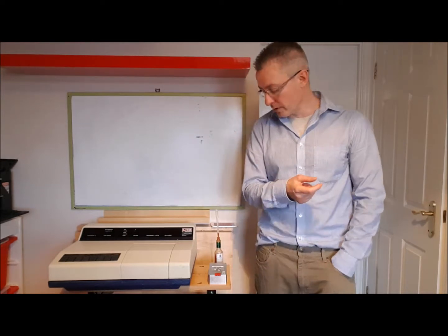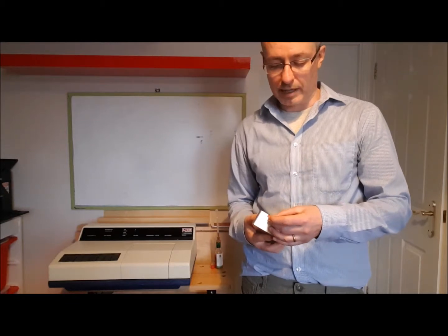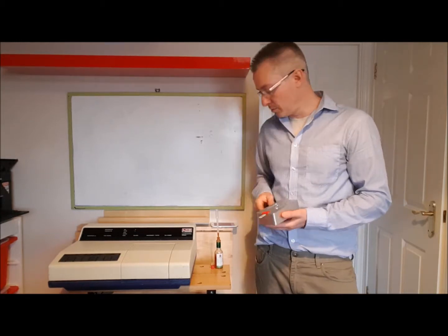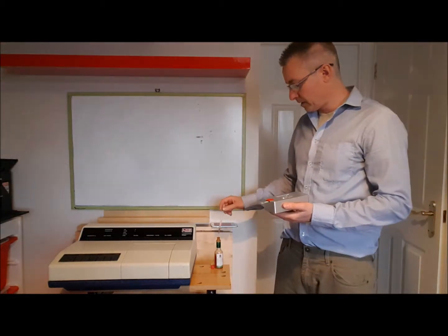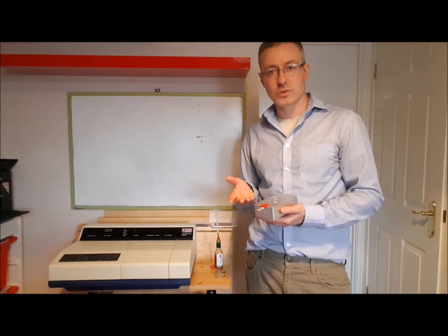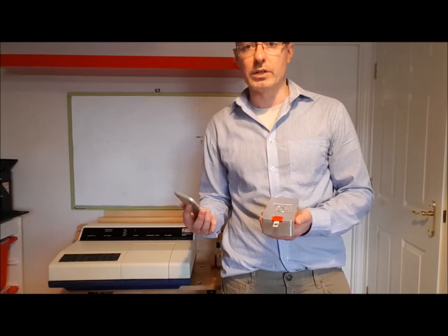Now I say all that because I want to contrast it with the Chili Pot Scoville meter. This is what we've licensed at the ZP Chilli group - we've licensed it from the University of Oxford, the Richard Compton group. If anyone's familiar with glucose strips and tests for diabetics, we're basically using those principles in this. It returns a Scoville heat unit result, and it's quite easy to use.